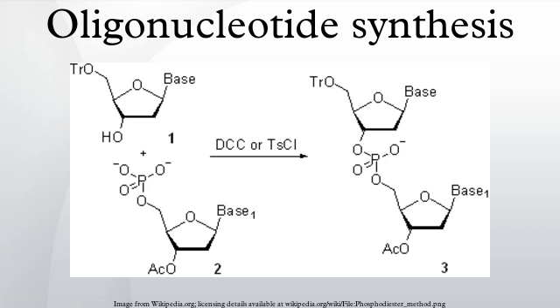Step 4, Oxidation. The newly formed tri-coordinated phosphite triester linkage is not natural and is of limited stability under the conditions of oligonucleotide synthesis. The treatment of the support-bound material with iodine and water in the presence of a weak base oxidizes the phosphite triester into a tetracoordinated phosphate triester, a protected precursor of the naturally occurring phosphodiester internucleosidic linkage.